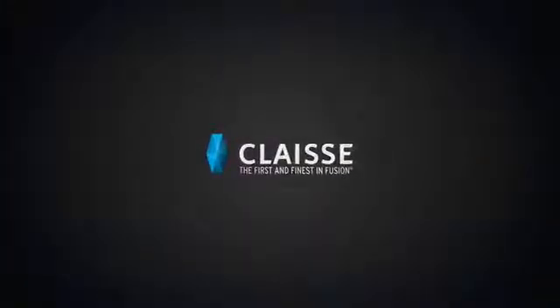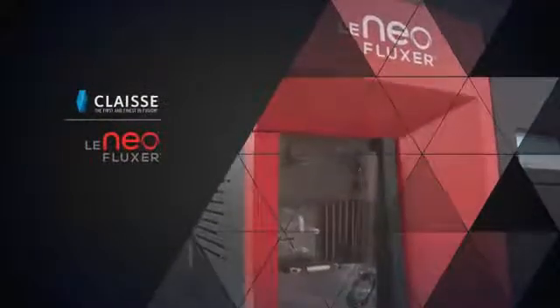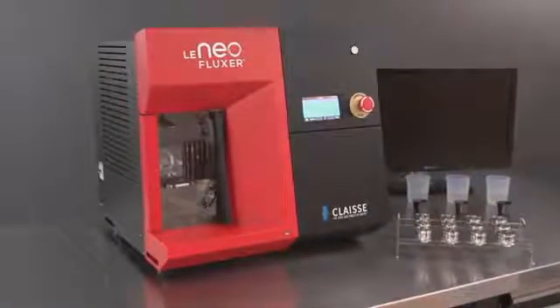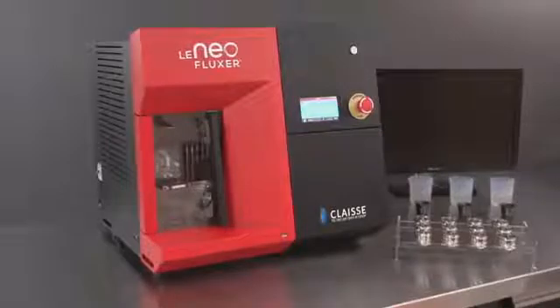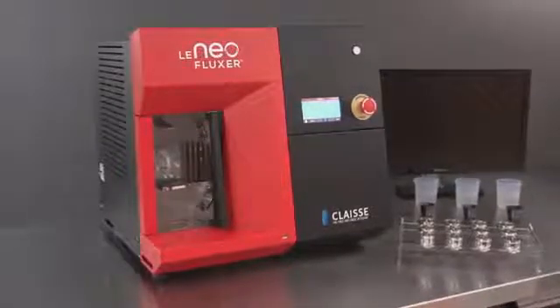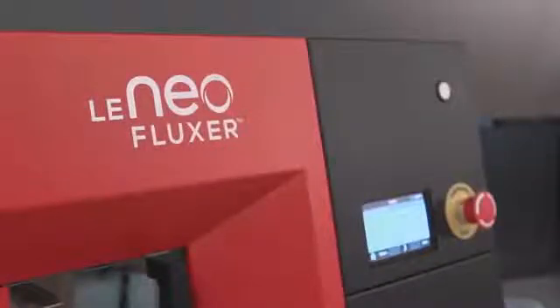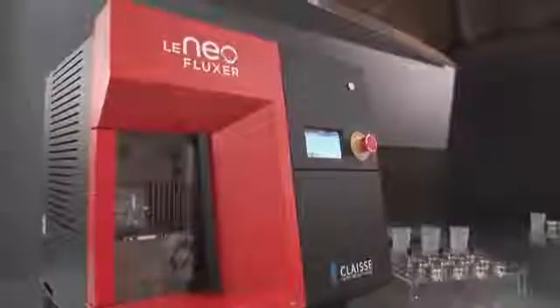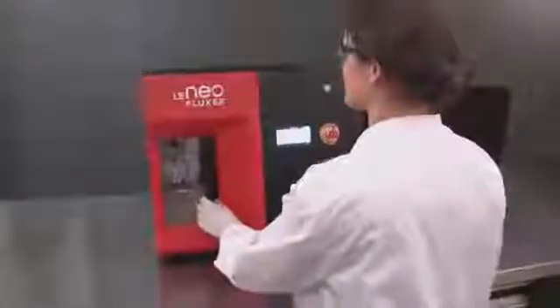Designed by experts in fusion, the LeNeo Instrument from the Claisse Fluxer brand is a fully automatic one-position fusion instrument that prepares samples for XRF, AA and ICP analysis. Electric. Compact. No compressed air or cooling system needed. No training required for operation — the LeNeo Fusion Instrument is ready to use right out of the box.